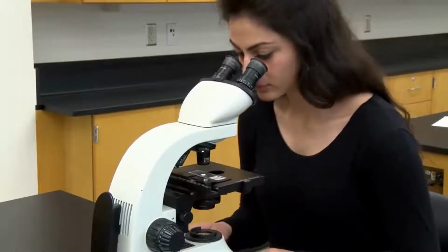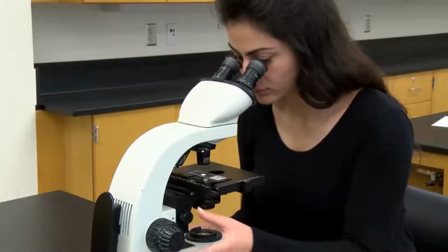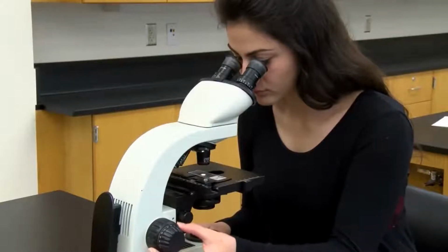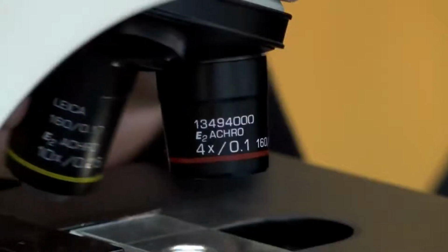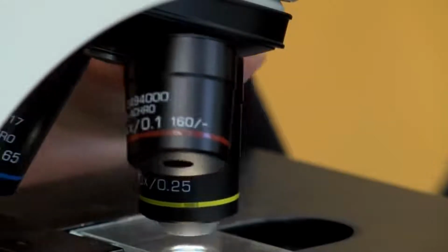Start with the low-power objective lens, 4x, and the stage in its highest position. Then look through the ocular lens and focus on the specimen, which should already be nearly in focus. Once you have found the specimen on low power, be sure it is centered in the field of view. Then move to the next highest objective lens, 10x, and refocus.